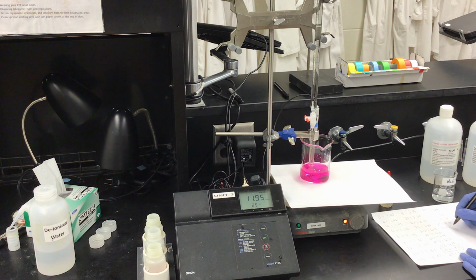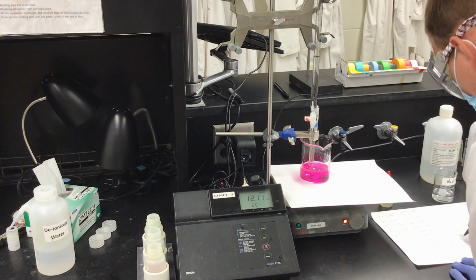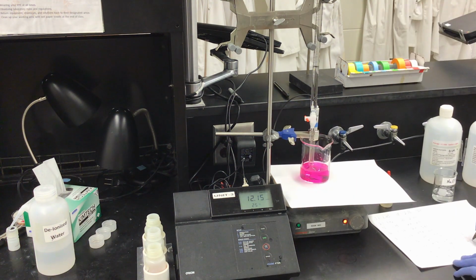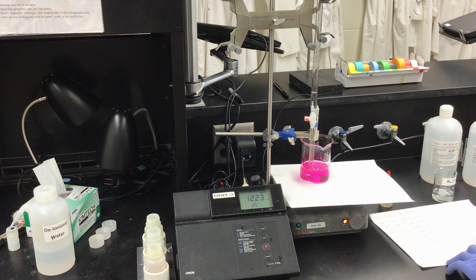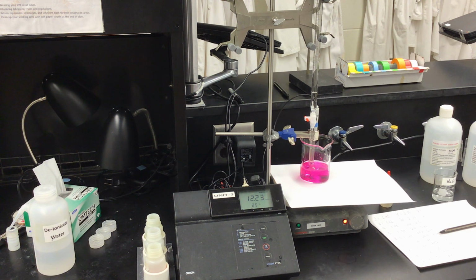At 37, we are at 11.95. At 39, we are at 12.01. At 41, we are at 12.06. At 43, we are at 12.11. At 45, we're at 12.15. At 47, we are at 12.19. And our final measurement will be at 50 mils added. We are at 12.23.